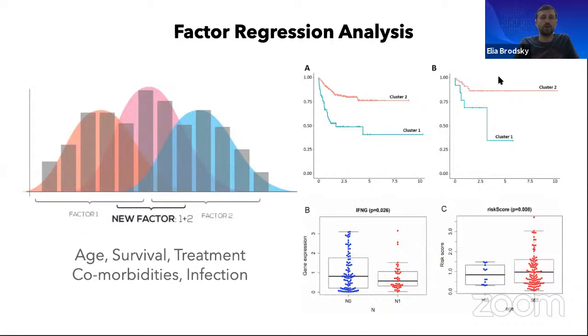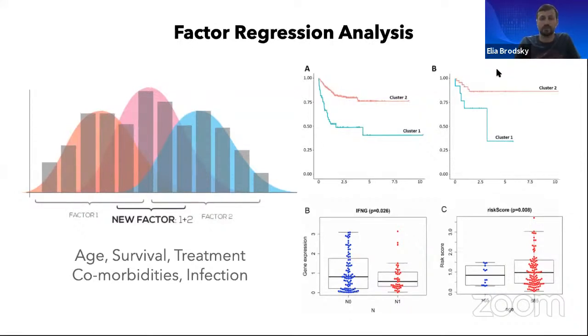And so what we will go through is not just exploratory data analysis and differential expression, but also we'll look at some of the ways we can apply regression to understand what are some of the relationships and important factors that contribute to observed effect in our data. For example, we'll talk about factor regression analysis and what unsuspected results it could shed light on when we approach this data from a data-driven perspective.